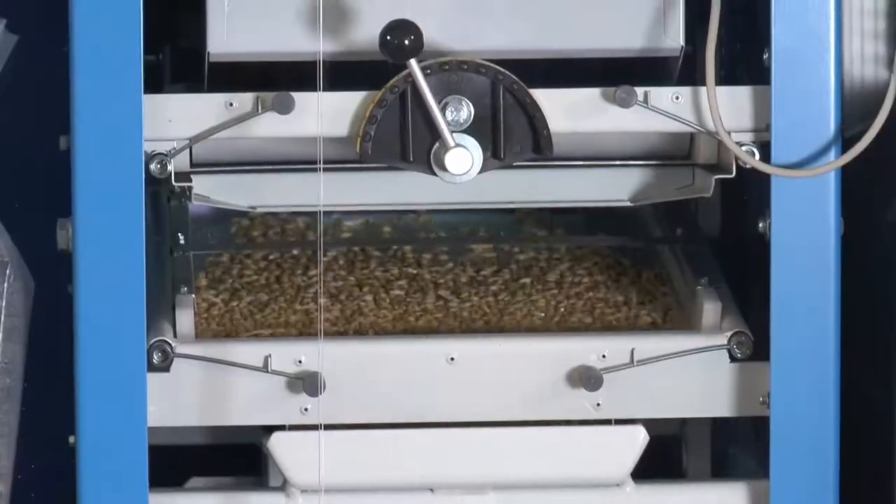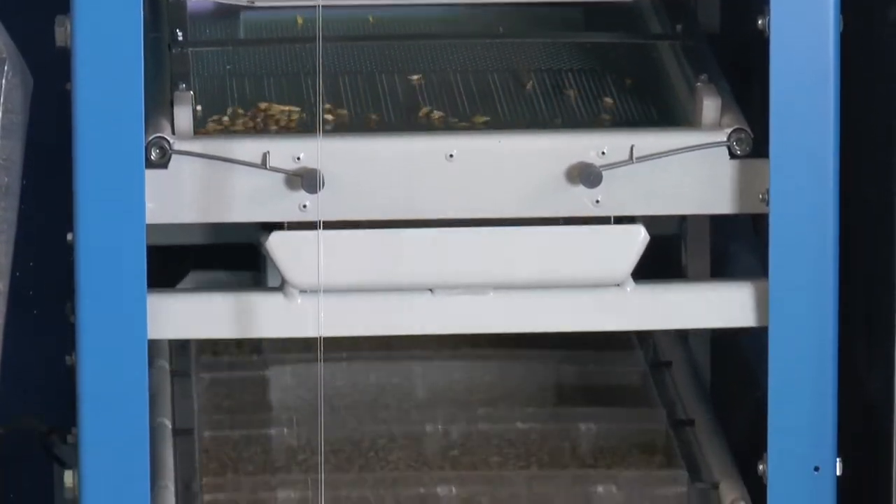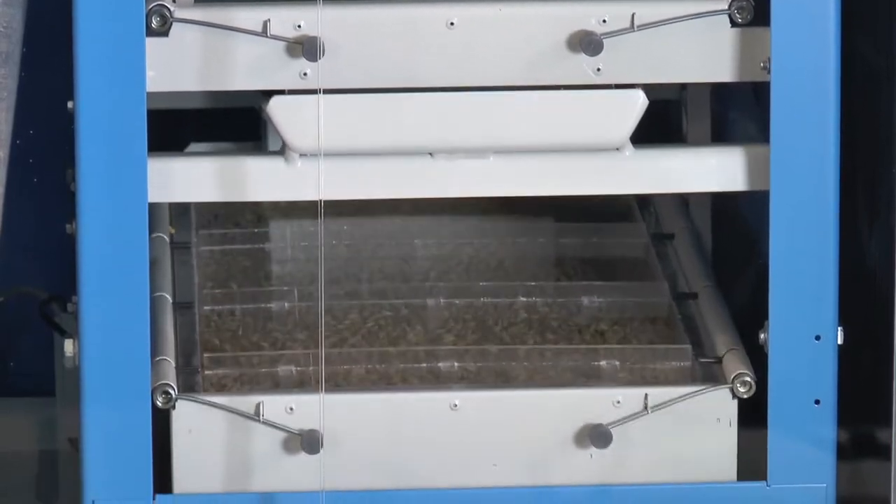After cleaning out straw and sand, the clean sample runs over the sorting sieve, which separates small and full grains.